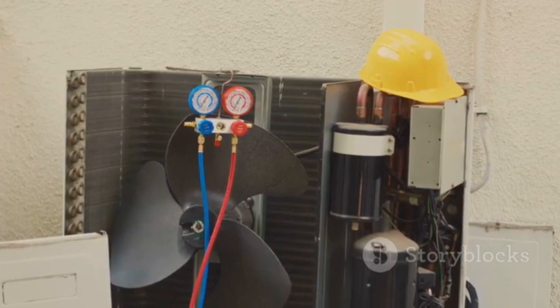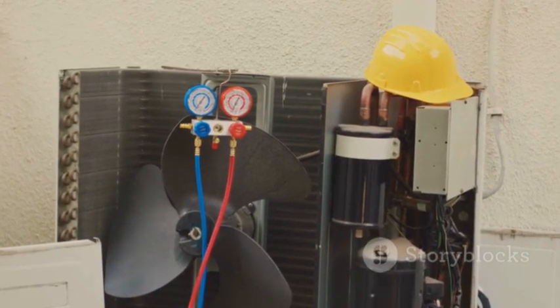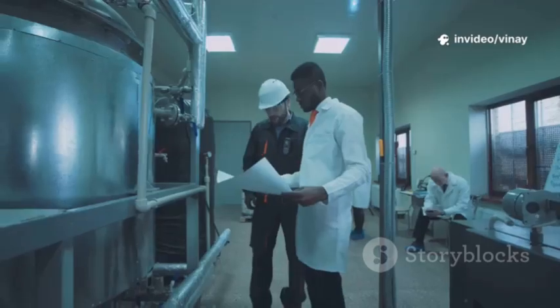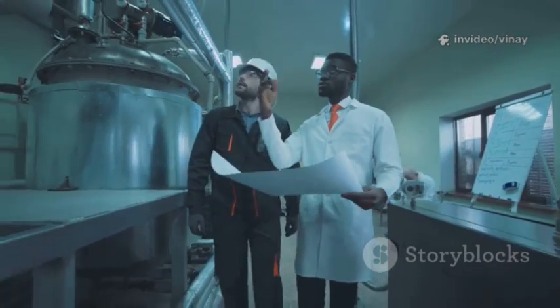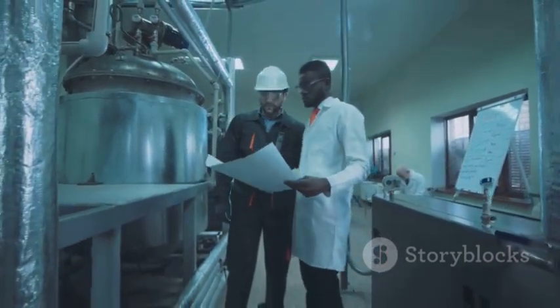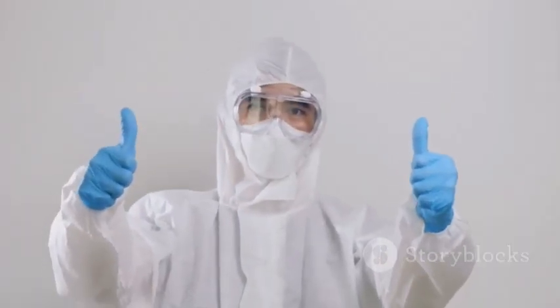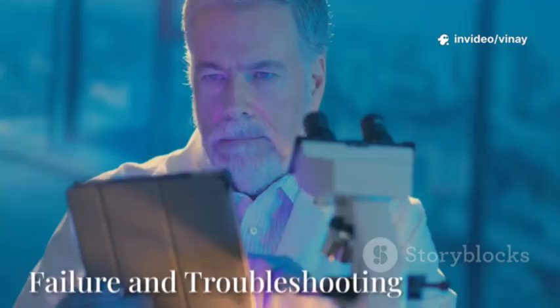The leak could be from a non-integral filter, a tear or an oversized pore, or it could be from a bad seal or a loose connection elsewhere in the test setup. This is an important point. A failed pressure hold test requires investigation to pinpoint the source of the leak. But as a screening tool, it's a very effective way to confirm that the entire filtration system, including the filter itself, is properly sealed and integral.